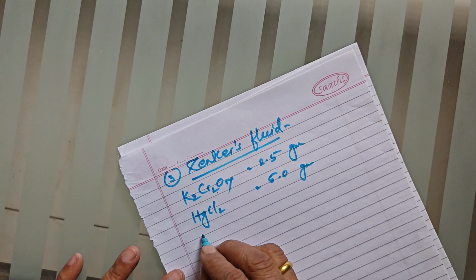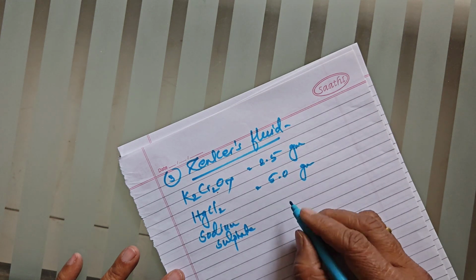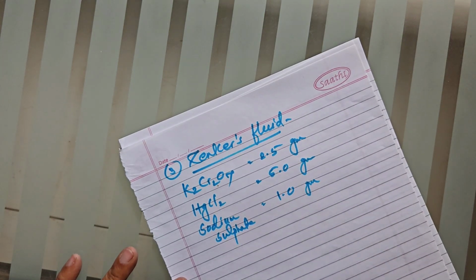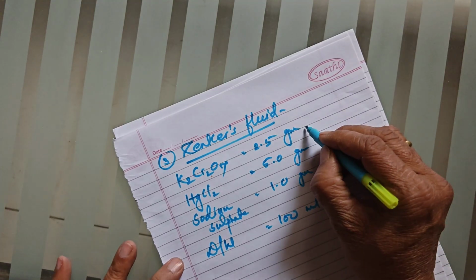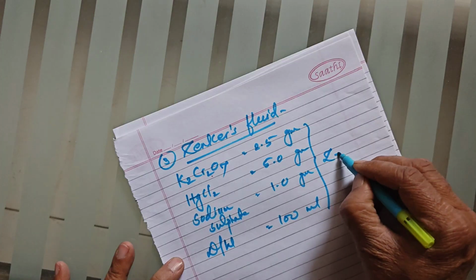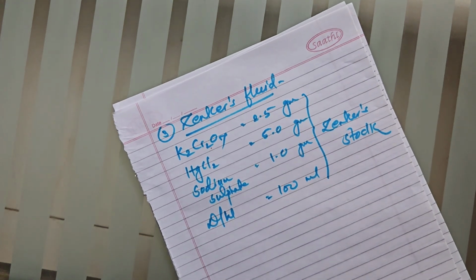Then take sodium sulfate, 1 gram. So these three solid materials are mixed in 100 ml distilled water, and this mixture is called Zenker stock.